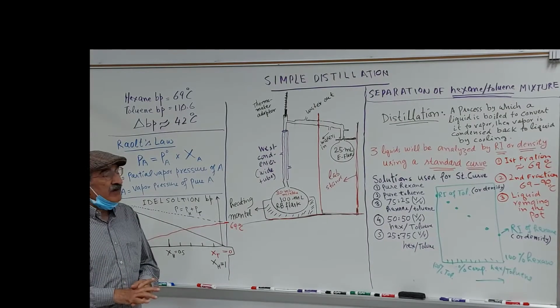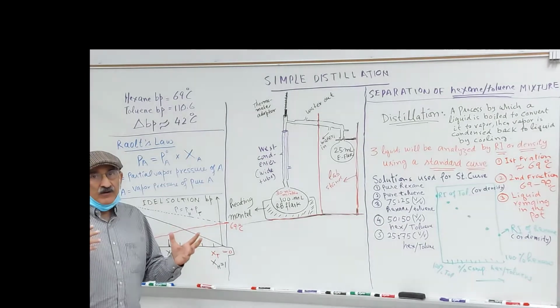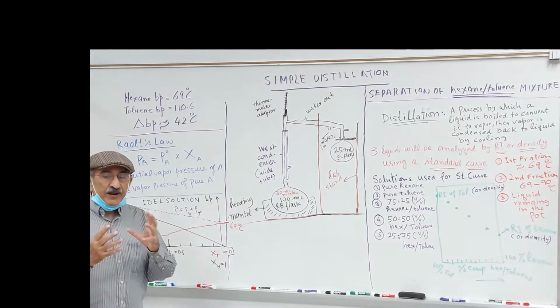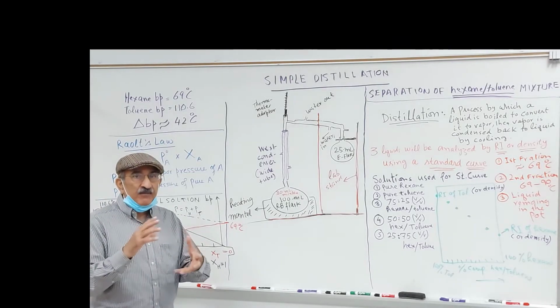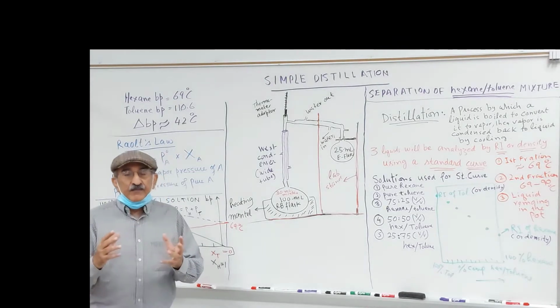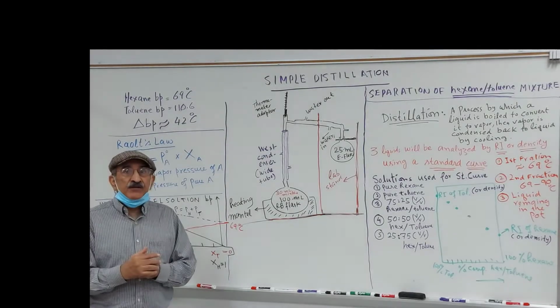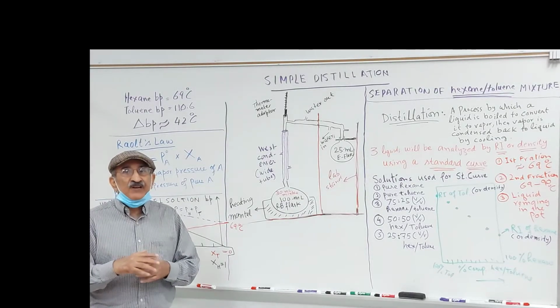And we thought that nothing could be simpler than we let you know how to separate two liquids that are mixed together based on their boiling points. So basically, what is distillation?